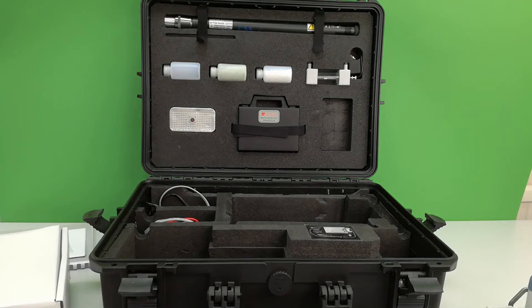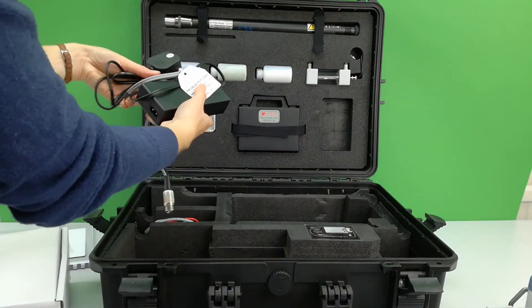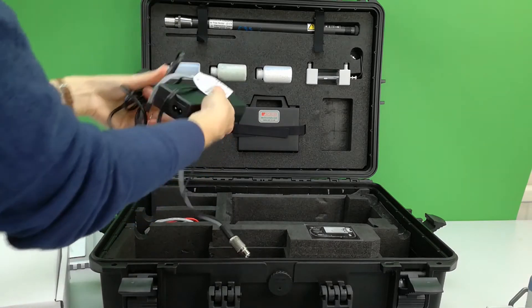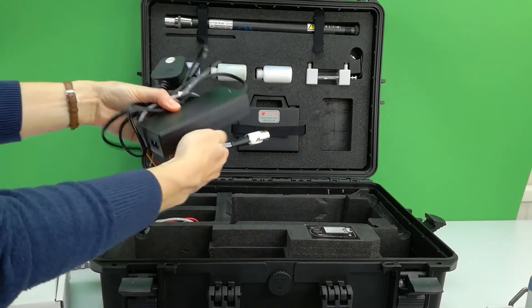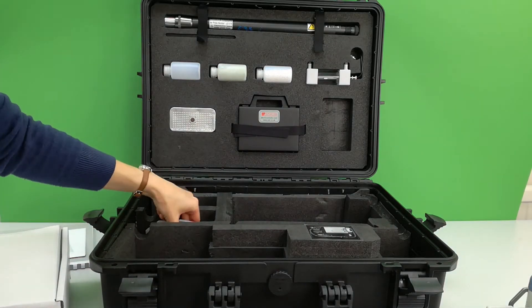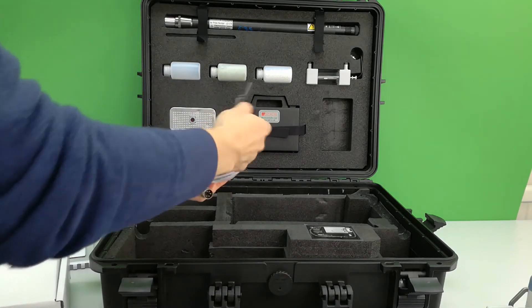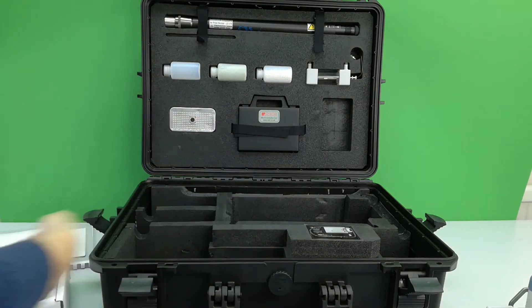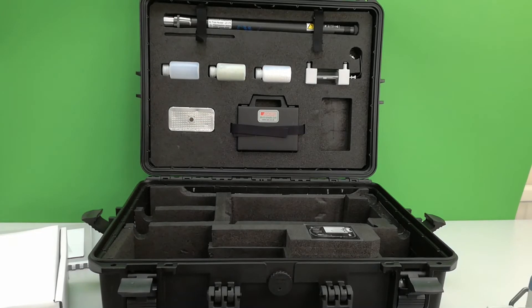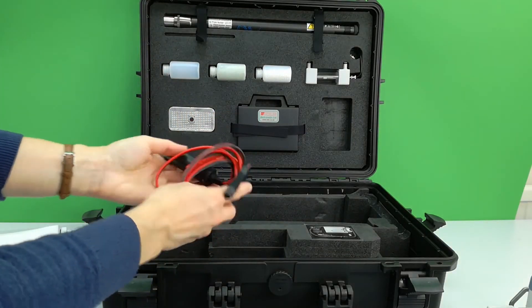A battery charger and mains power supply are provided with a regionally appropriate plug socket. Another optional power supply cable is given with clips for an external power bank. A car port charger cable is also provided for emergency field charging.